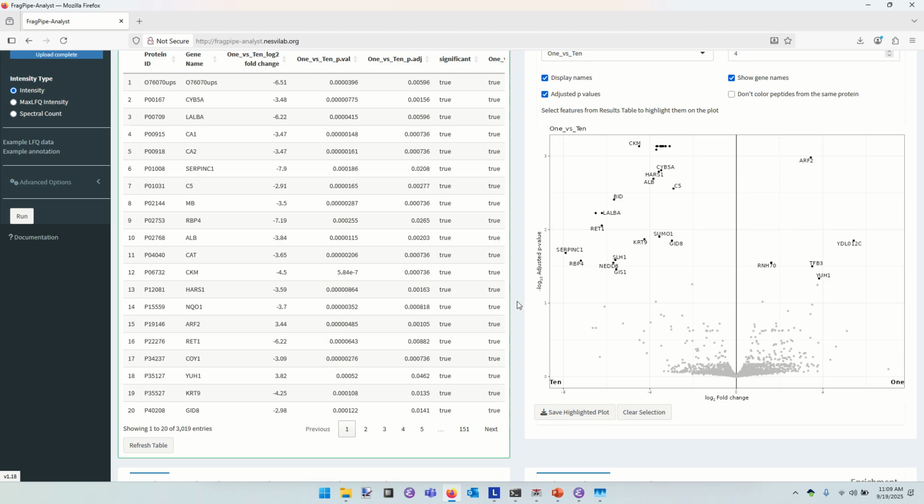Measured 0 versus missing value, everyone get that? Okay. So the software is using imputation to fill in some value randomly selected for that missing value. The model that it uses for this can be configured under advanced options. I tend to leave it at default, but your mileage may vary.